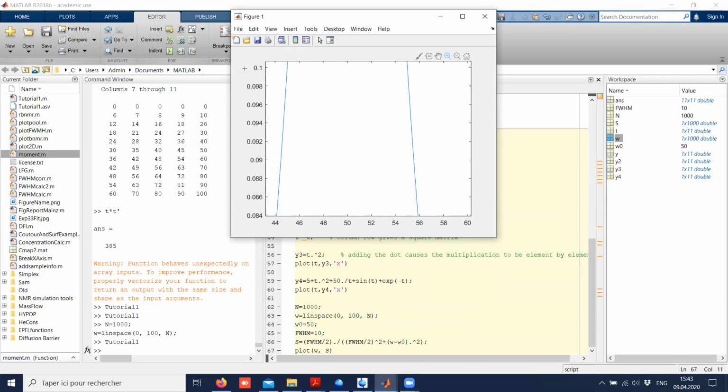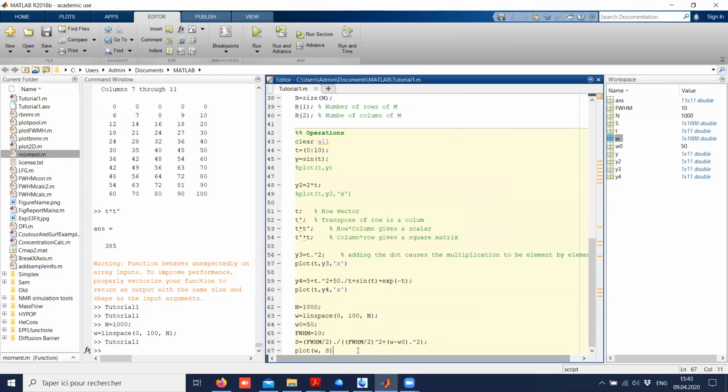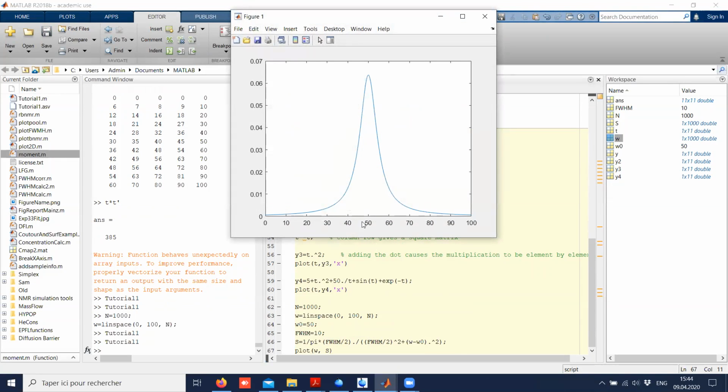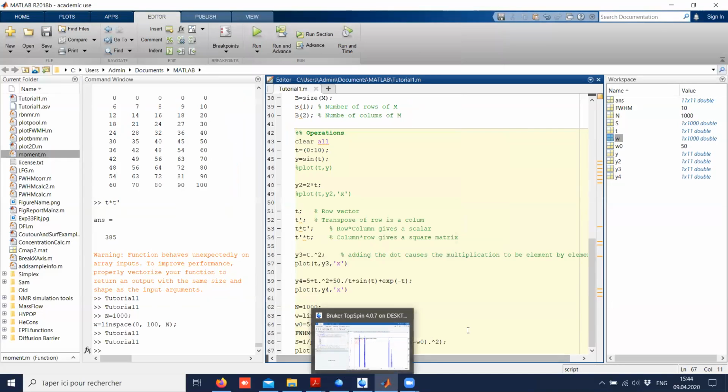It should be something like 10, because I've chosen the right way of writing the full width at half maximum. And if you want it to be normalized, which is quite useful to know, this will have an integral of 1 written like this. It's more convenient when you do fits. And to my eyes, this is the clearest way to write the Lorentzian function.